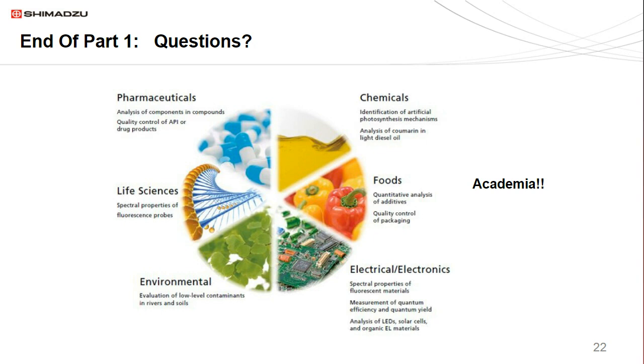That's why if you're working with an ionizable compound, you want to make sure you're at least 2 pH units either on the low side of the ionization constant or on the high side. That will ensure that you're dealing with only 1 ionic species. If you need to work in the middle near the ionization constant, you just have to have a very good buffer so that your pH doesn't change during your assay.